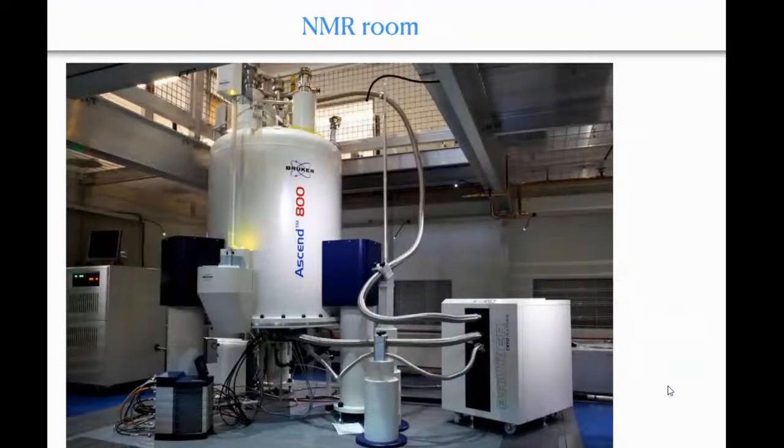So this is a typical NMR room. This is not our room. We don't have an 800, we have a 700 here. This you see is the magnet. This is where the magnet is.